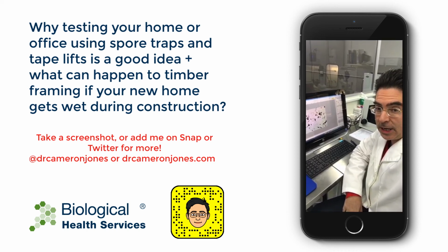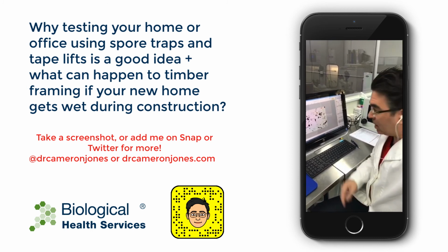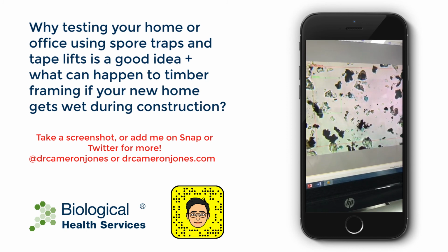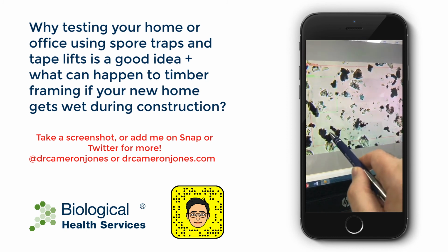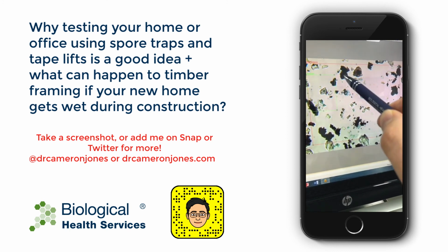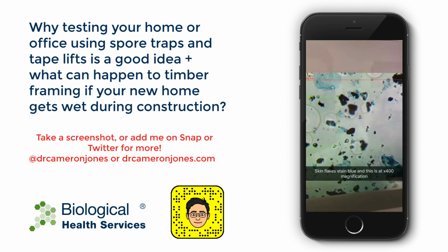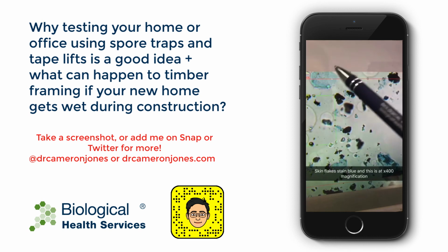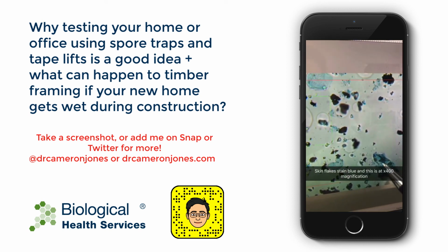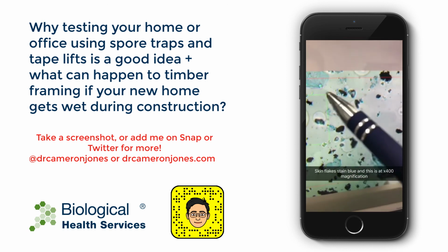Now, if you haven't seen city air under the microscope, you're in for a surprise. Have a look at this. Now, this is the same spore trap taken a few seconds ago in that street. All these black coloured deposits, they're diesel particulates out of cars. And now I'm pointing out the blue ones now. These are skin cells, so this is quite common and not unusual.